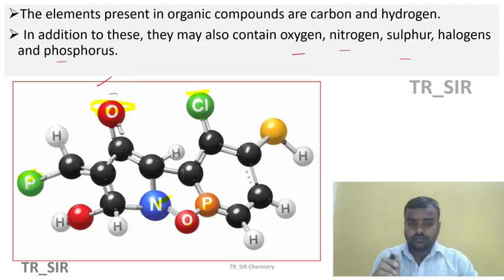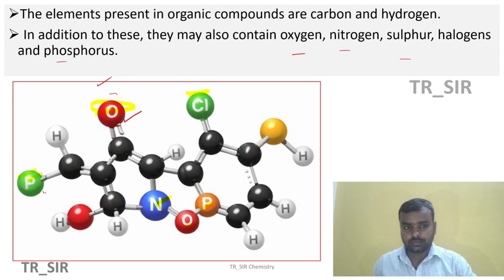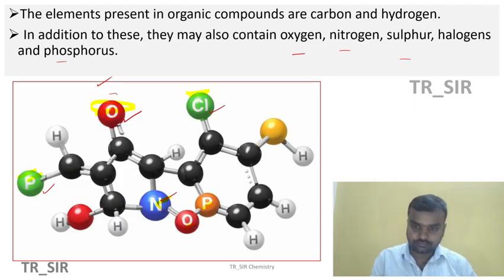Now we'll see how to detect oxygen, phosphorus, chlorine, nitrogen, as well as oxygen. We'll see the methods one by one. Up to this, clear? Okay.